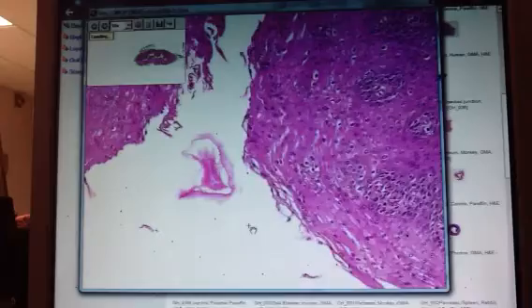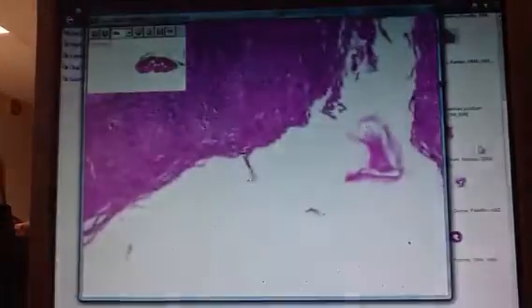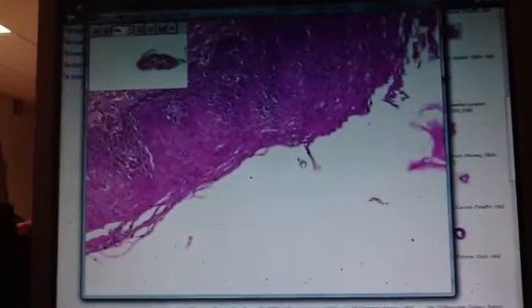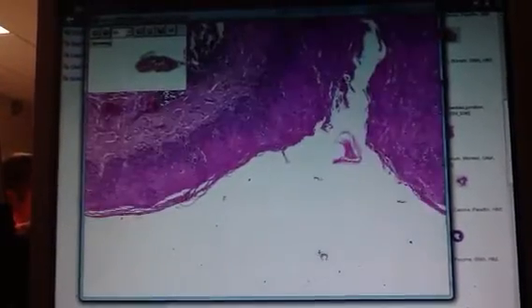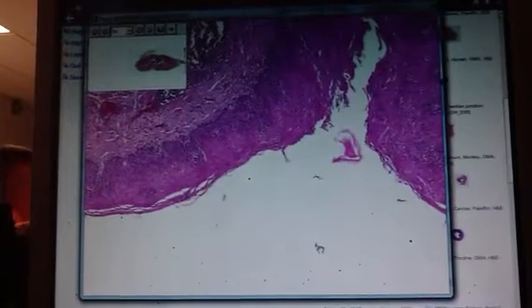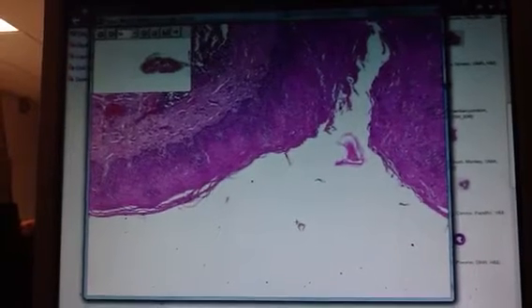Dr. Spears? Yes? One question. Just like, because on the other side, it kind of looked like, so we just assume that that's all epithelial and it's nothing else? There is no assumption, it all is epithelium. But like on the other side, it looked like there's a big thick layer behind it on the kidney, but you're like, just that skinny part was epithelium.